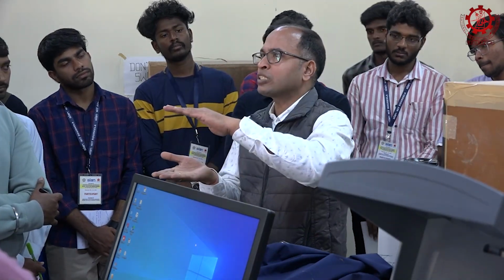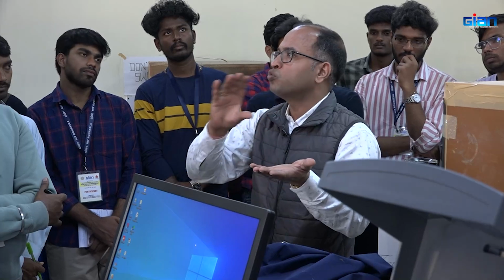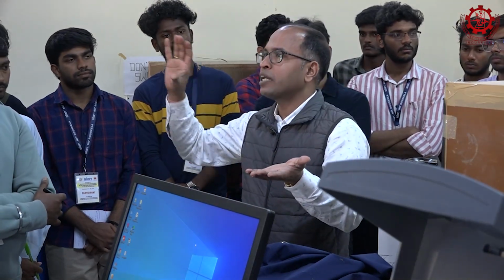So he brings sample, we do analysis, and we know how ethanol will be characterized in NMR spectrometer. Now we tell him that, okay, this is the concentration of ethanol in this sample. Now he brings another sample, there we see if the concentration is higher or lower. Now for example, he collects the sample 1 day, after 2 days, after 3 days. If the ethanol concentration on the first day is less than on the second day, which is less than on the third day, that means with increasing days, the fermentation is going higher.